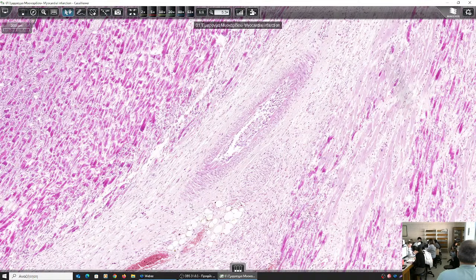The cells that you showed in the chronic inflammatory, they are lymphocytes? Mononuclear cells. Yes. Mainly lymphocytes. Because macrophages are also cells of the acute phase of the inflammation. You don't care about the time? No, but they are too little. They are too few.